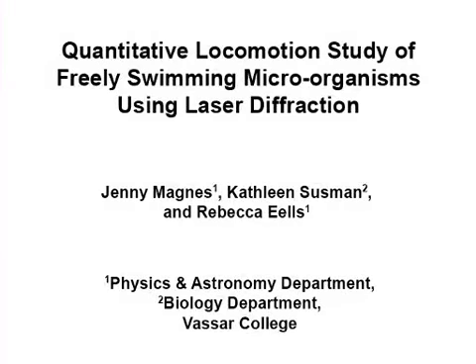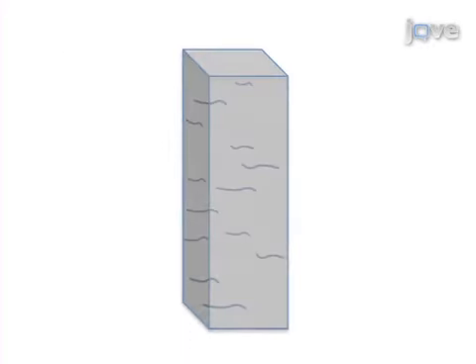The overall goal of this procedure is to measure thrashing frequencies of freely swimming microscopic organisms. This is accomplished by first preparing a sample of microscopic worms.